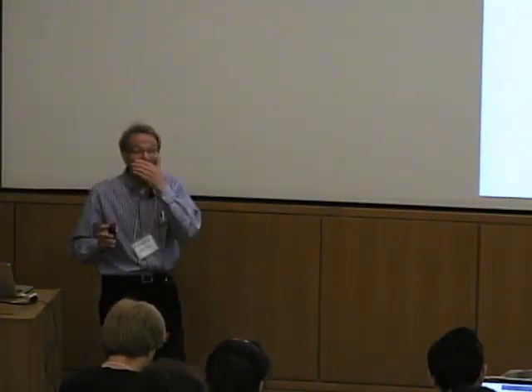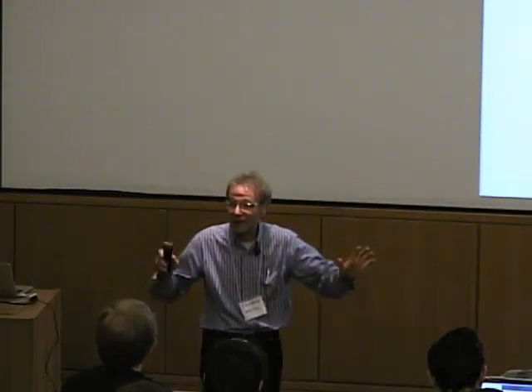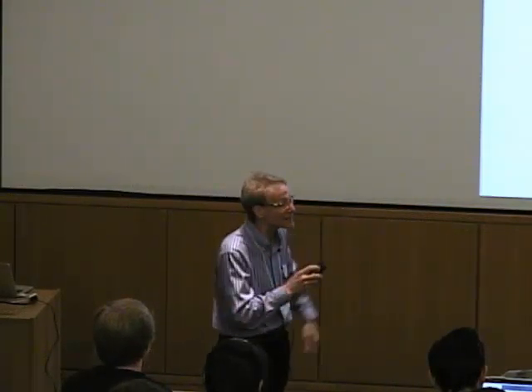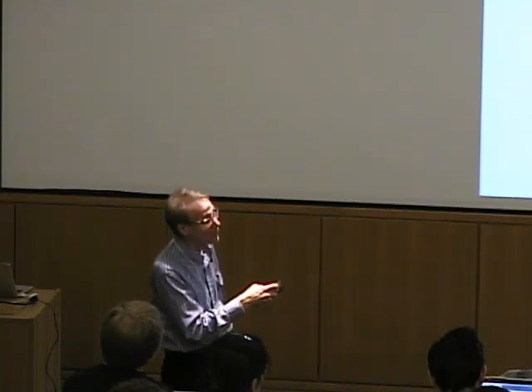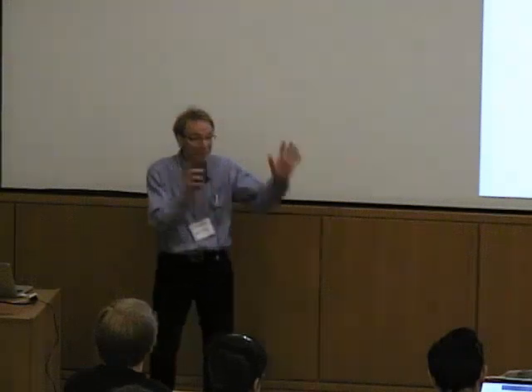Now, the analysis goes back again to general chemistry, Hess's law. Everyone remember Hess's law? Summation of enthalpies. So basically, we're measuring the overall enthalpy of the reaction, which may involve multiple equilibria. So we have to account for all these different enthalpies of the metal-buffer interaction and protonation of the buffer to finally get what we're interested in. This is the type of post hoc analysis that we need to do.